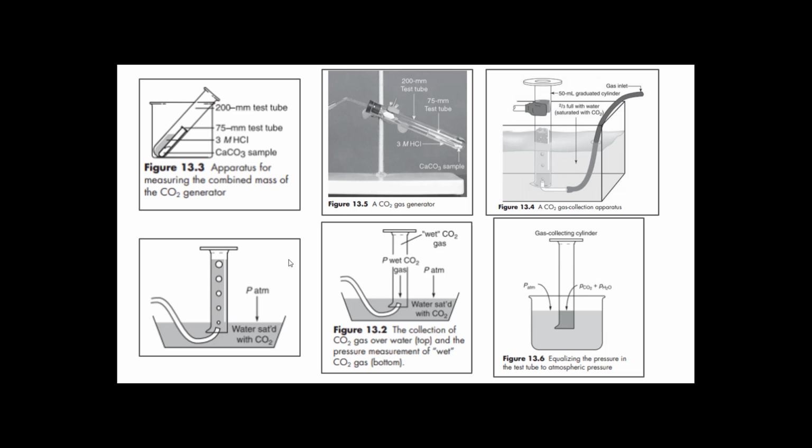All right, these are my own words on this lab and how you're going to go through it. You definitely should read the instructions. I'm sure Entis has a whole bunch of questions on the lab and you don't want to miss it. Do not ever blame me, because I am telling you right now, I'm putting this in my own words. He might ask for some stuff. So the first thing you need to know is what the generator is.